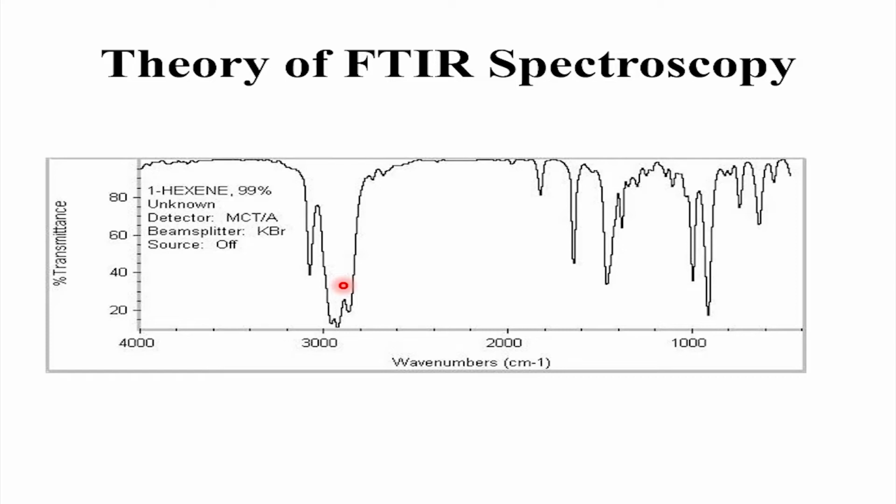Depending on what hybridization it has, the bond strength will be different. Even though the carbon hydrogen mass has not changed, since the hybridization is different, we will have a different bond strength. As the bond strength changes, we can see there are 3 different absorptions for carbon hydrogen. If all three were the same hybridization, we should get only one absorption peak.